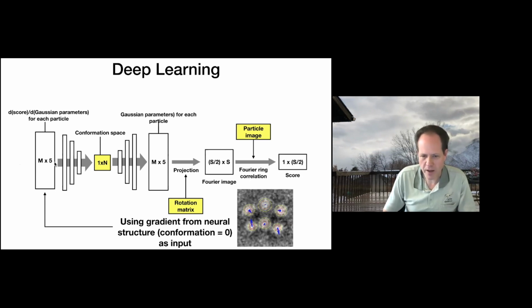The encoder then reduces the data down to what's called a latent space, which has very few variables. So here you may have 10,000 variables, and then that gets reduced down to say 4 variables in this intermediate space. And then the decoder inverts the process. It takes this latent space and tries to turn it back into something that's the same size as what you put in.